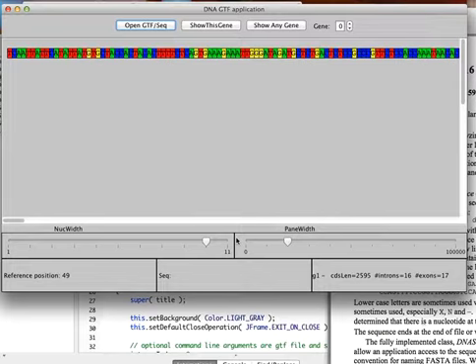and that file and two others are in the starter code. Just to see how the layout is here, the files that get opened have multiple contigs, which are sequences of DNA that have been determined to belong together and match the real organism. These are seldom full chromosomes, but depending on how good the assembly and the sequencing is, they can be pretty large sections of the DNA. The samples we have are pretty large, at least the larger ones.